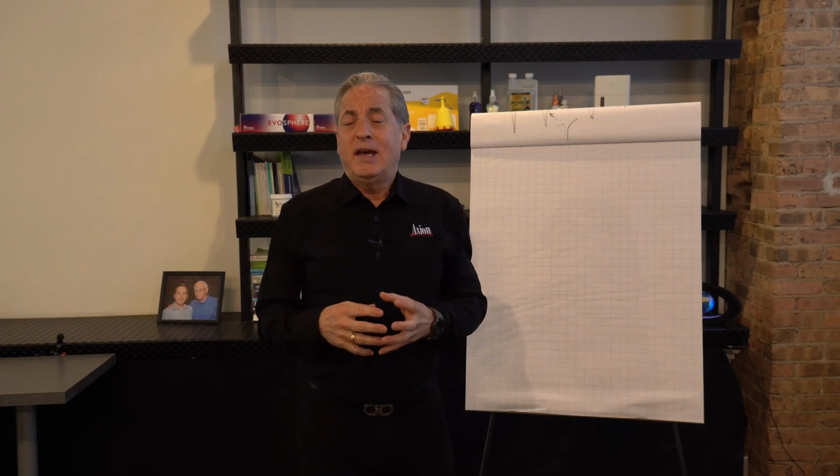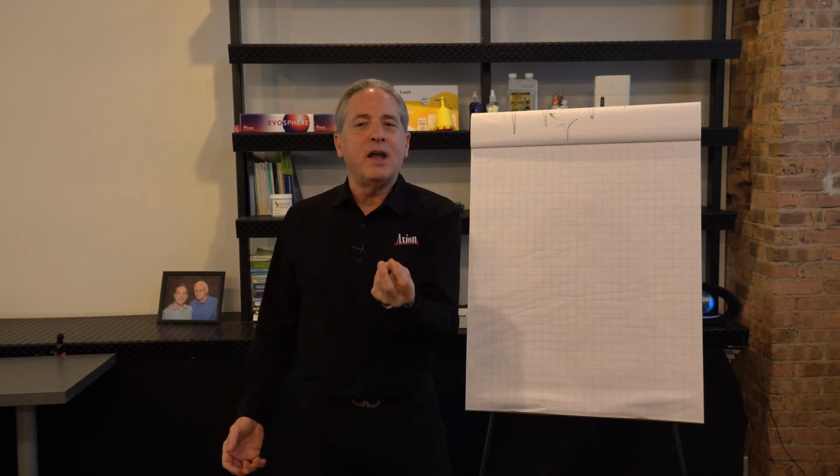If we look at typical HPLC silica, we're talking about like 100 square meters per gram. That means 1 gram of material has 1,000 square feet. Now, some of the material in the MacMod world, we're looking at over 300 square meters per gram. We're talking like a 3,000 square foot, like the size of a giant home inside of the column that you're buying. Why is that impressive? Why do we care about high surface area?